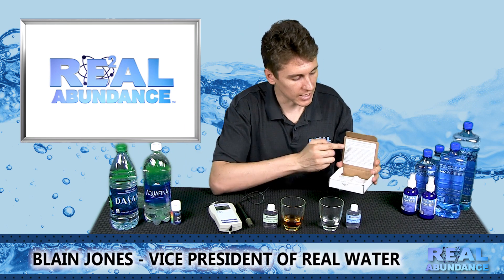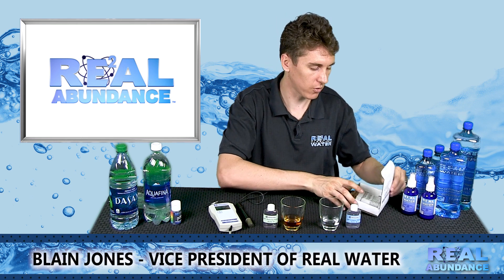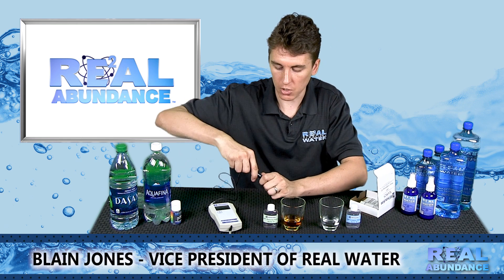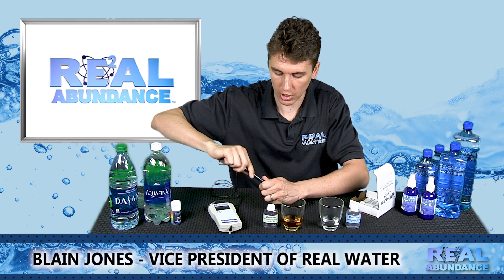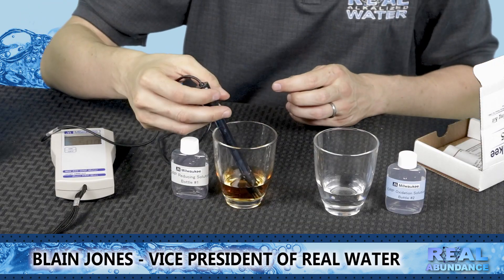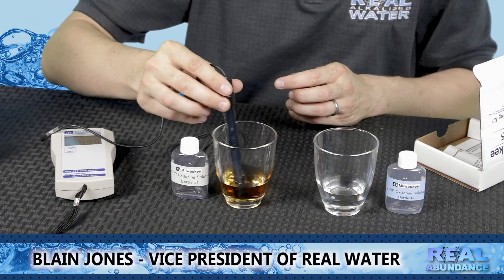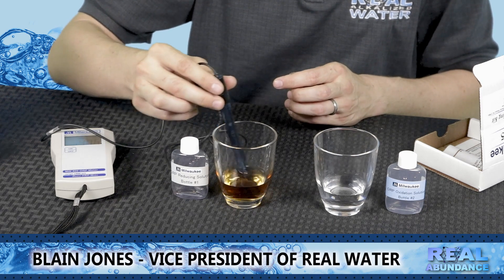The kit gives you instructions on how to do this procedure properly, but we can show you it now. The first thing you are going to do is take your ORP Meter and the probe. Take the storage cap off and place it in the first solution for about 60 seconds, turning and spinning it to move everything around and get it to soak into the probe nicely.